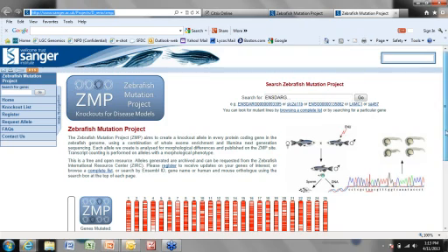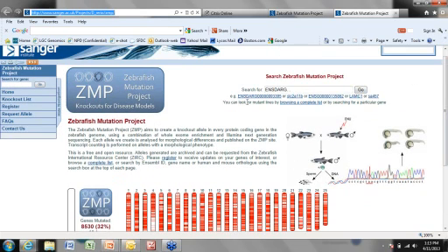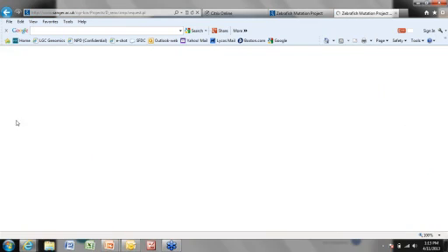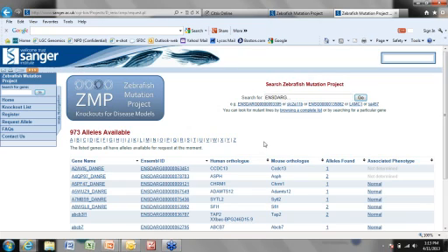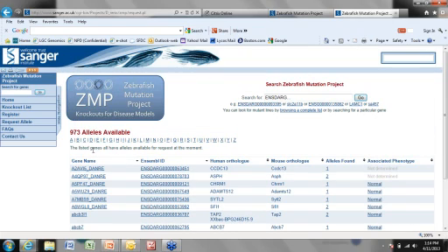And you can see, they got markers across all 25 chromosomes, and you can search. You can look for mutant lines by either browsing the complete list or by searching for a particular gene. And you can request alleles and order up the zebrafish containing these mutants, and eventually the knockout zebrafish as well. And these are all sorted alphabetically currently. Again, you can search it by the complete list or by entering in gene name.